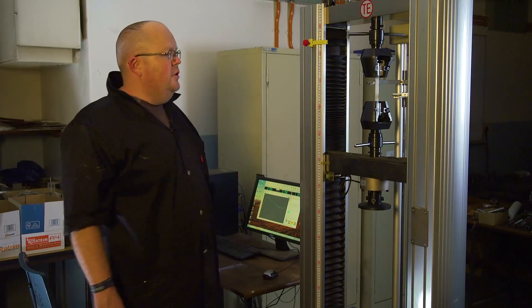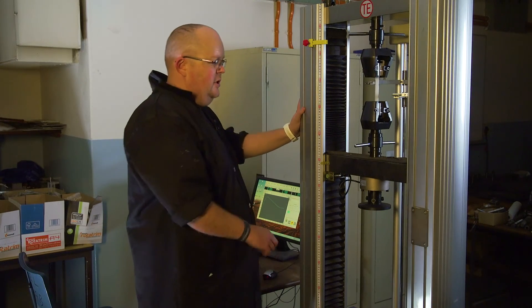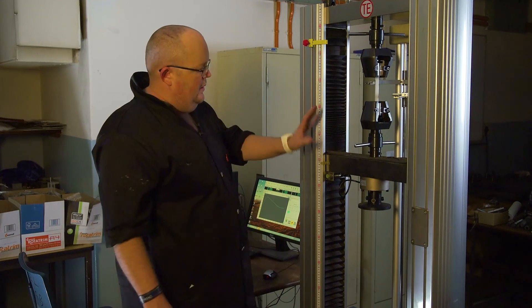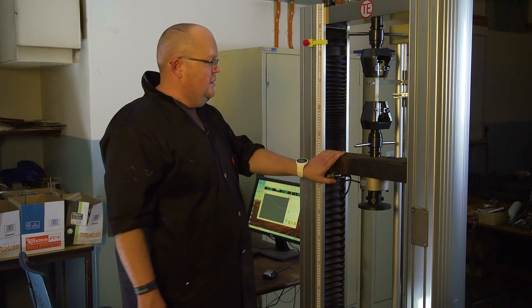This is a TE universal testing machine. We will be using this for our polymer testing, similar to the Shimatsu we showed in the metals video. It has a cross head which can move up and down, so we can do tensile and compression tests on this machine.